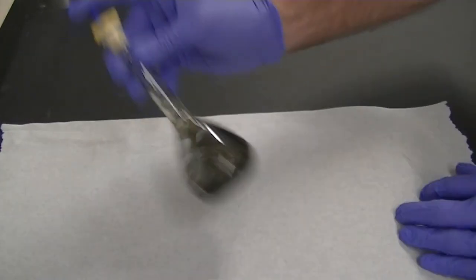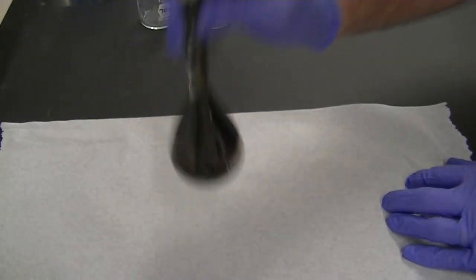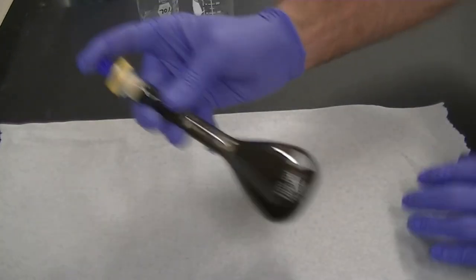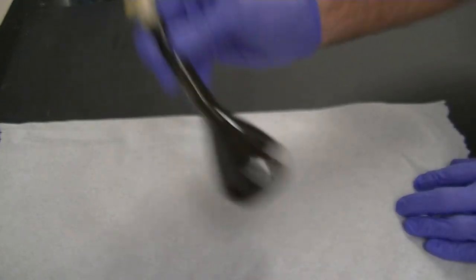Once both fluids were added to the flask, I shook the flask to encourage the silver metal that was formed to coat onto the sides of the flask. I shook for a really long time.